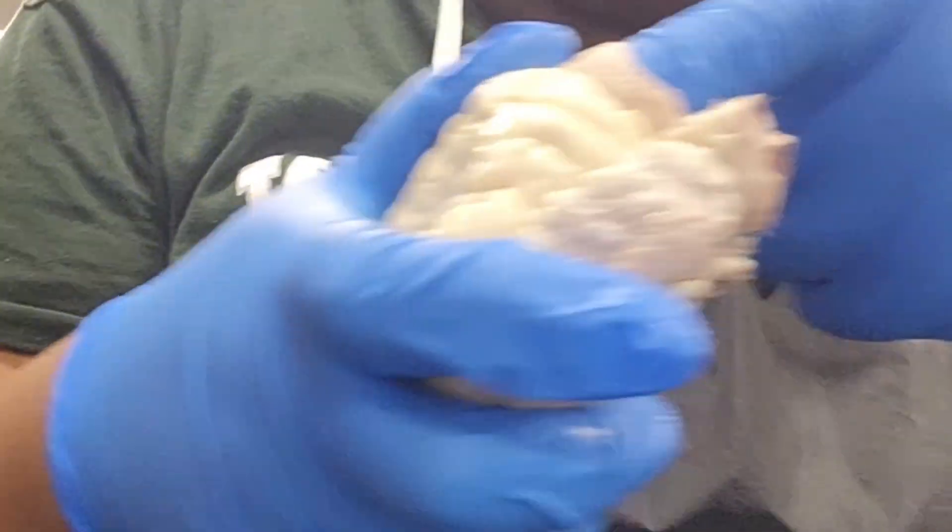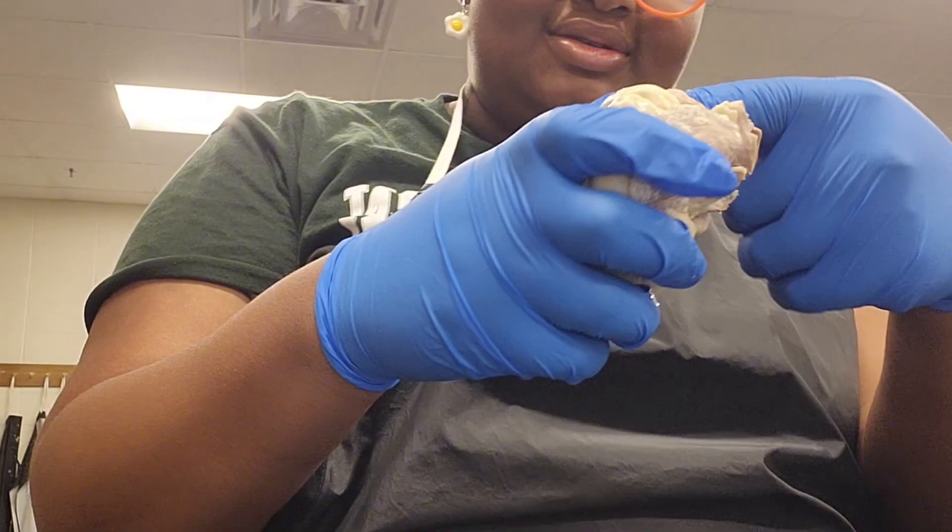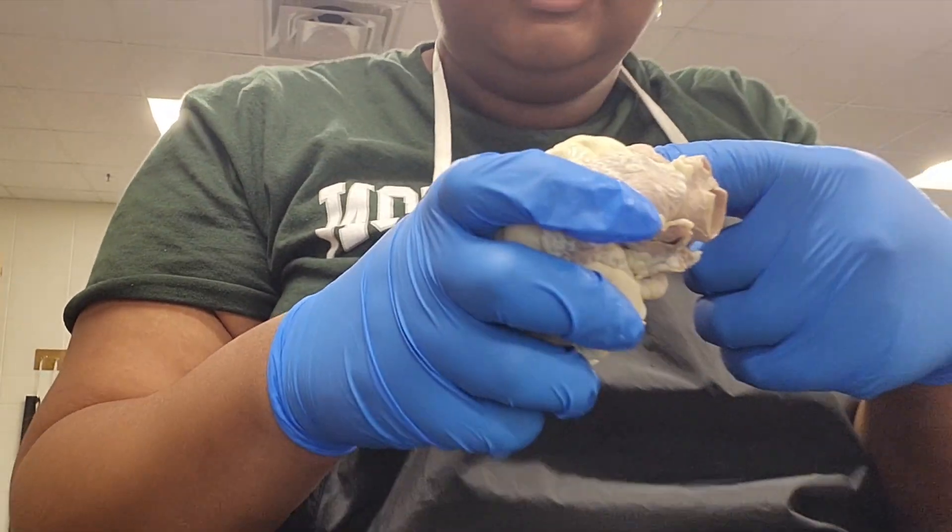However, since every heart is different and since some of these arteries and veins have been severed, it is a little bit hard to tell, so I could be wrong.